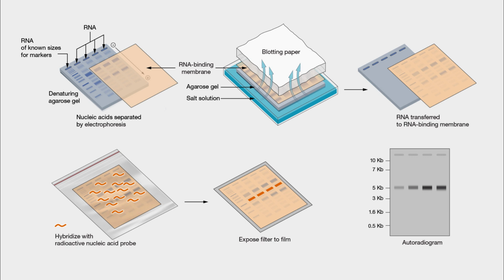In human tumors, changes in the expression levels of cancer-causing genes are frequent. Northern Blot analysis can be used to investigate whether a gene is overexpressed or underexpressed in cancer cells as compared to normal cells. Overexpression means the cancer cells produce or transcribe too much RNA from the gene.